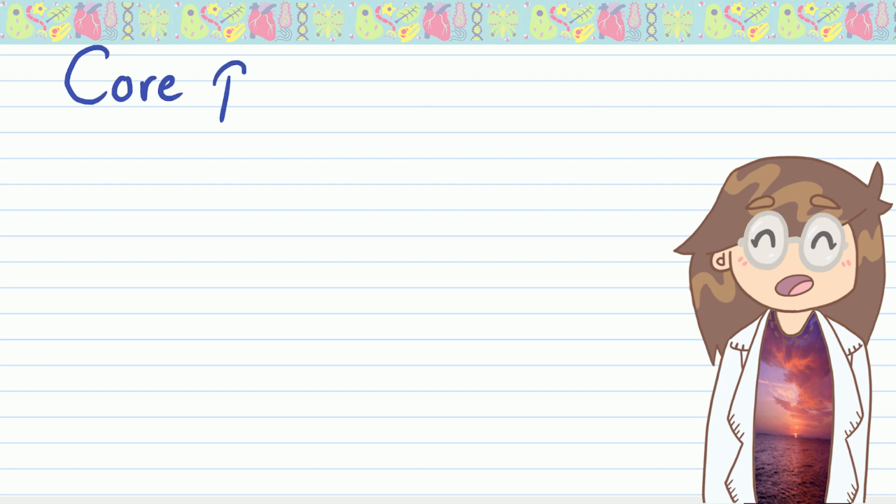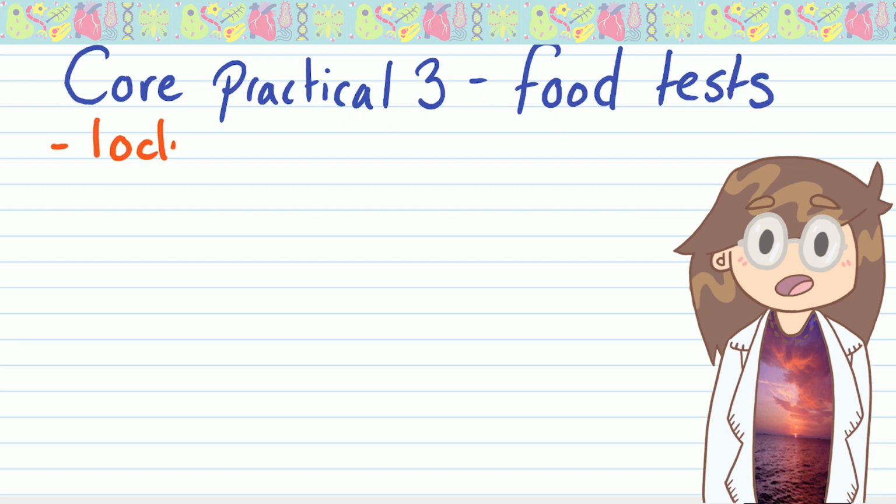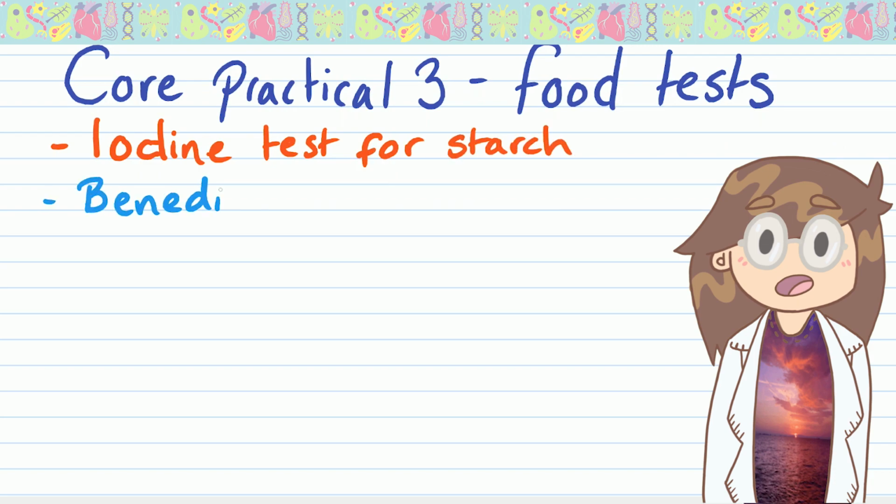Hi everyone, welcome back. Carrying on with some organisation today, we're going to be looking at one of the core practicals, which is food tests. Now, food tests is a pretty simple practical to do. It just requires the knowledge of quite a lot of chemicals and reagents and things.